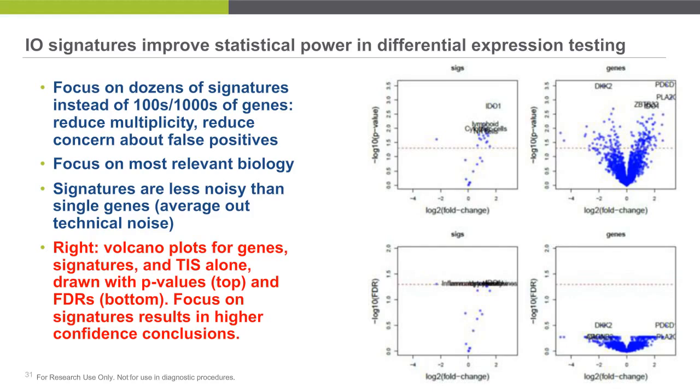We're not 100% confident, but we expect that less than 5% of these discoveries will go on to be false. If we look at the bottom right volcano plot, false discovery rate of our single genes, we find that even our strongest p-values, those below 0.001, only amount to a false discovery rate of about 70%. So we're really left with no high confidence conclusions here.